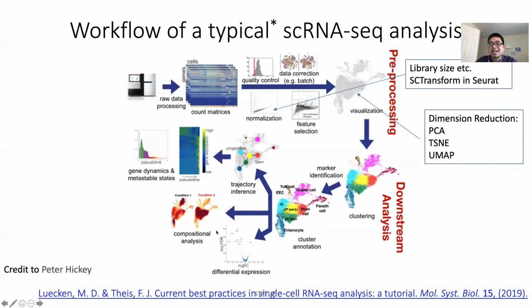The single cell ATAC-seq analysis follows a similar workflow with some special treatment for the count matrices, since the data are much sparser than single cell RNA-seq. So as you can see, there are many steps in the workflow. And to streamline the analysis, our lab, Shirley's group, developed a tool called Maestro.